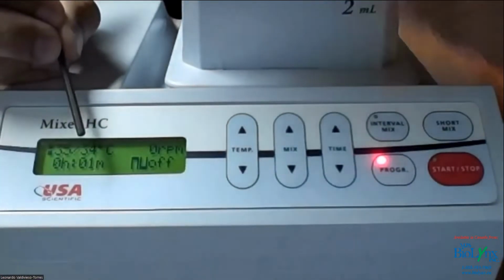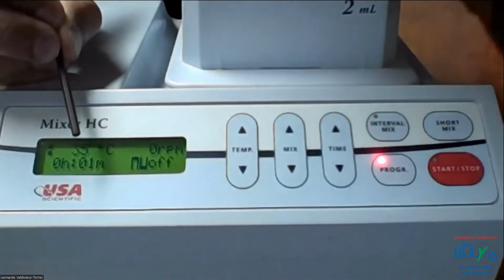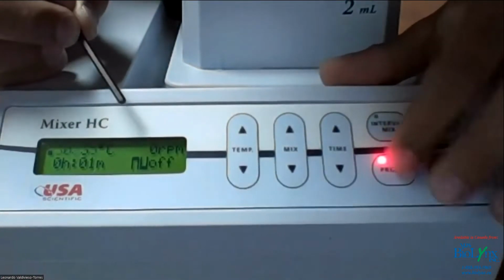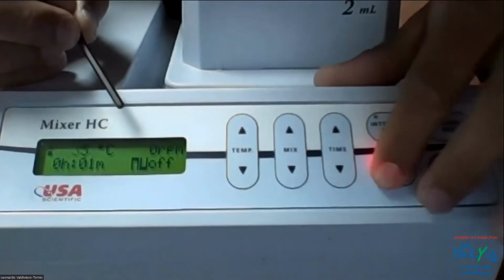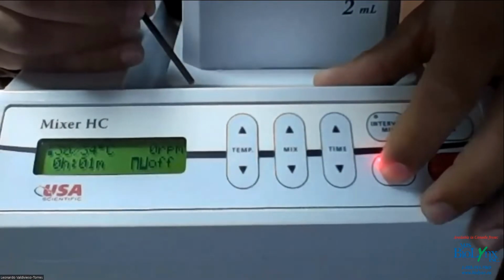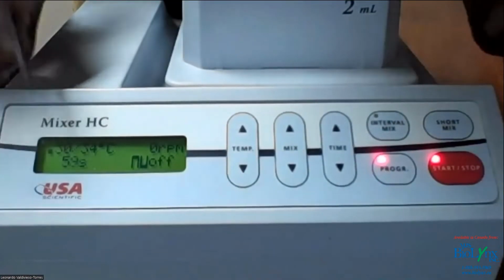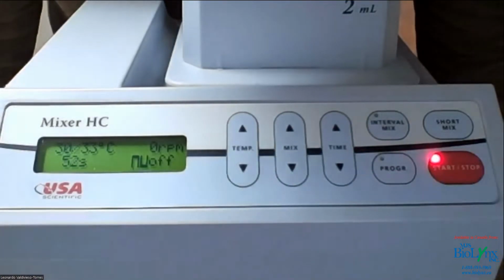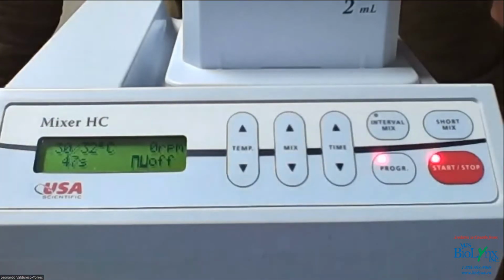In your case, you would go 42 degrees Celsius for 15 minutes, and then you would do 95 degrees Celsius for 5 minutes on the second step. Now to start the program, simple, I'm gonna go back to step 2, 0 RPMs, because we don't need mixing, no interval function. We go back to step 1 and we click start. And that's it. If we go to 30 degrees Celsius for 1 minute, then it's gonna do 1 minute for 35 degrees Celsius.